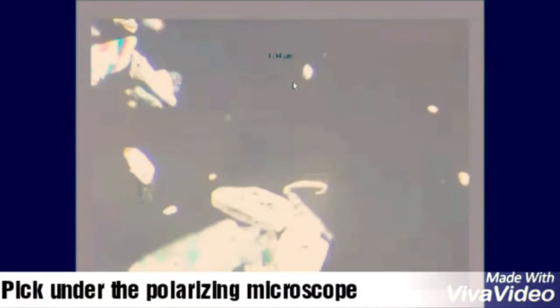Without further ado, let's see how this test is carried out. First, select a crystal to be used in this test. Since the crystal is such a small material, you will have to view the crystal under a polarizing microscope. This type of microscope will help you choose a better piece of crystal, because usually a crystal will extinguish light at 90 degrees.